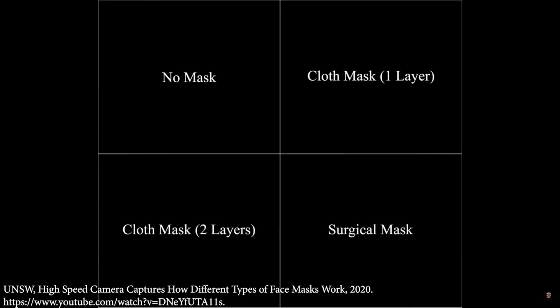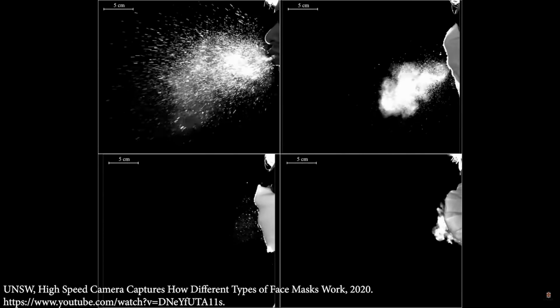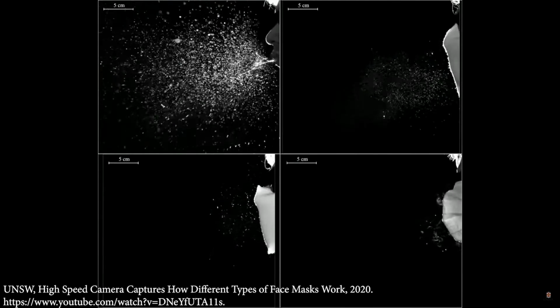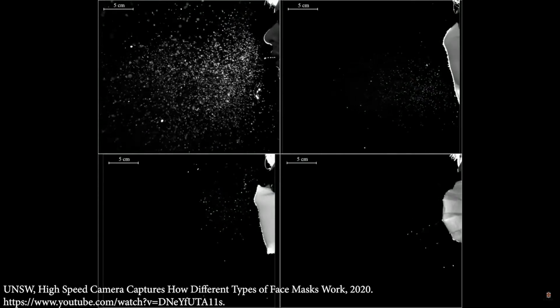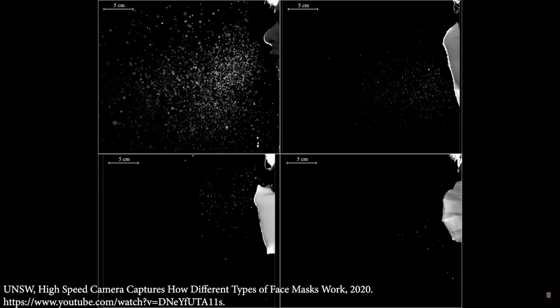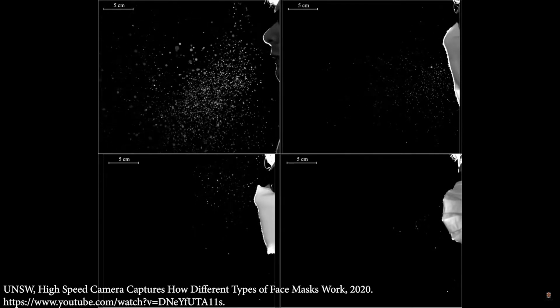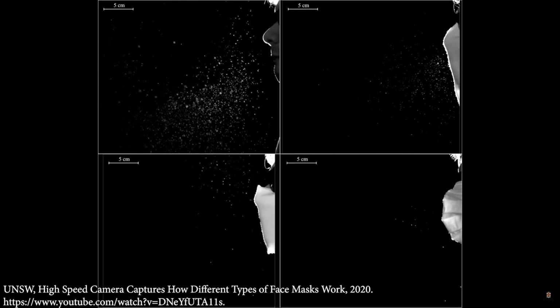Now, another gross example of aerosols, but a really important one now with coronavirus, and one of the reasons that it propagates so well, is sneezes. When you sneeze, achoo, you generate bunches and bunches of aerosols, and these aerosols are really small particles with molecules encapsulated in solvents and liquids, and they float through the air, but because they're so small, they also can dry up really, really quickly. And we're going to rely on this for the electrospray mechanism.